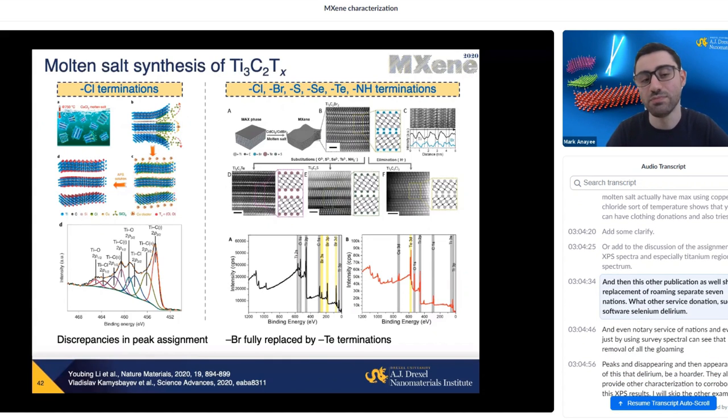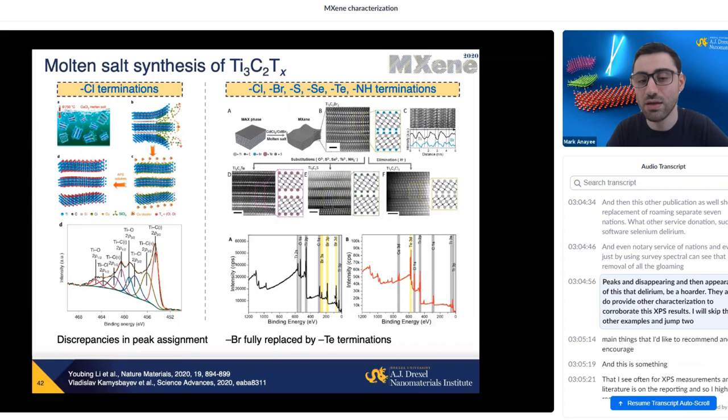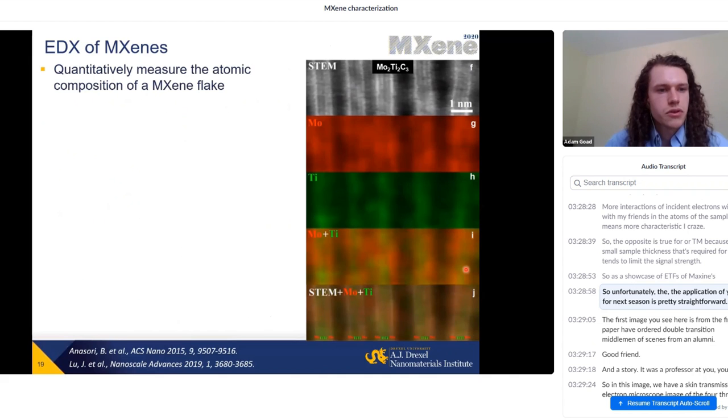And then this other publication shows replacement of bromine surface terminations with other surface terminations such as sulfur, selenium, tellurium, and even no surface terminations. Even just by using survey spectra, you can see the removal of all the bromine peaks disappearing and the appearance of this tellurium peak. However, they also provide other characterization to corroborate these XPS results. This is pretty straightforward.